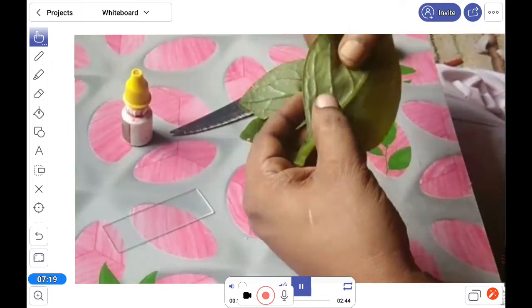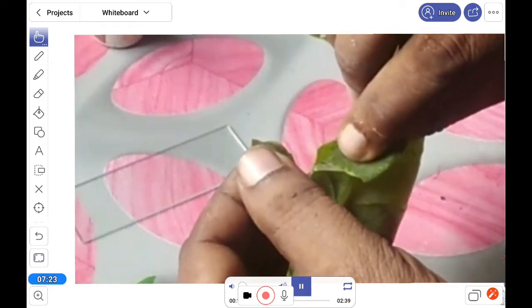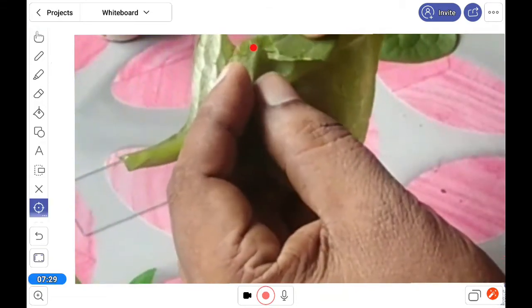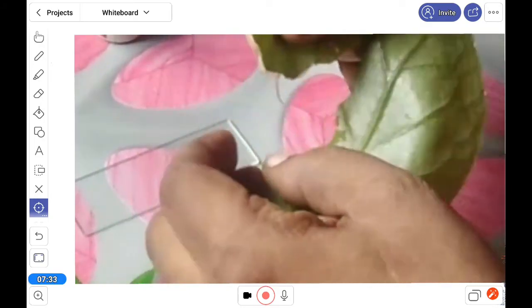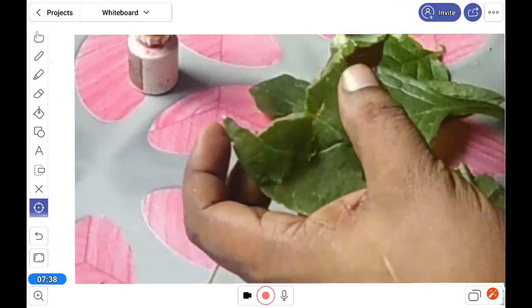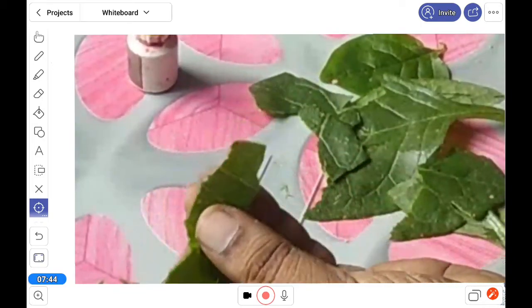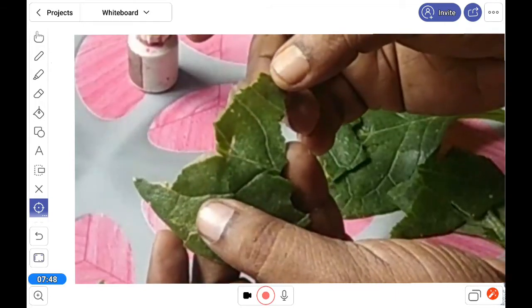See, my front is the lower surface. Now I am tearing it in such a way that the peel comes out. This is the peel. Only a very small part is required, so don't worry if only a very small part comes out. If I do the upper, then the upper peel will be there, and you will transfer it. So this is the practical.